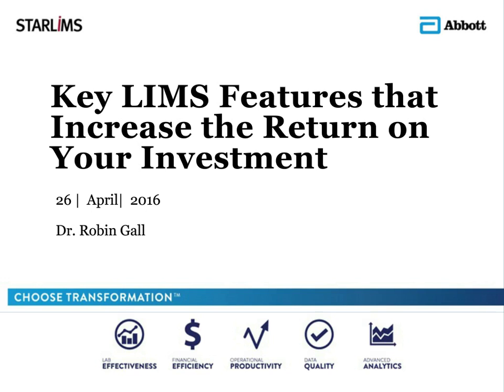Now, there are a lot of these products out there on the market, so today what we'd like to discuss is what key features we can look for to increase the return on our investment. This investment that you're going to make when you purchase a laboratory information management system is one that you're going to have for probably 7 to 10 years. So you'll want to make sure that you choose a product that's going to fit the needs of your agency, not just today, but also into the future.